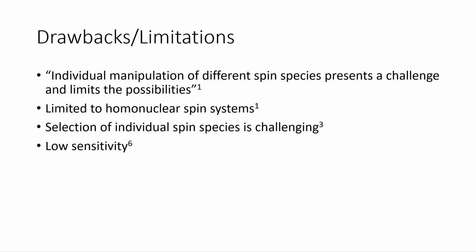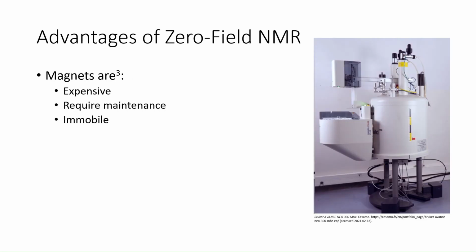Over all of this, the main disadvantage is low sensitivity. There is negligible spin magnetization. Therefore, an external source of spin polarization is needed.